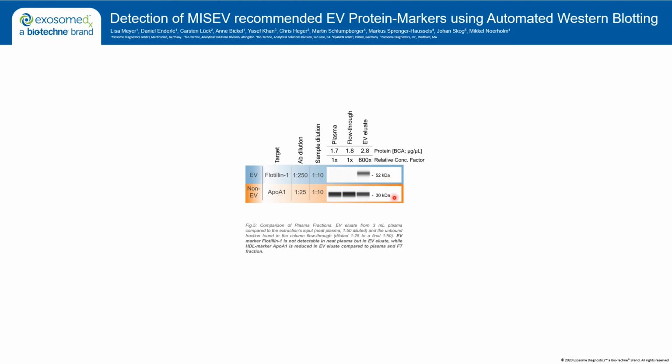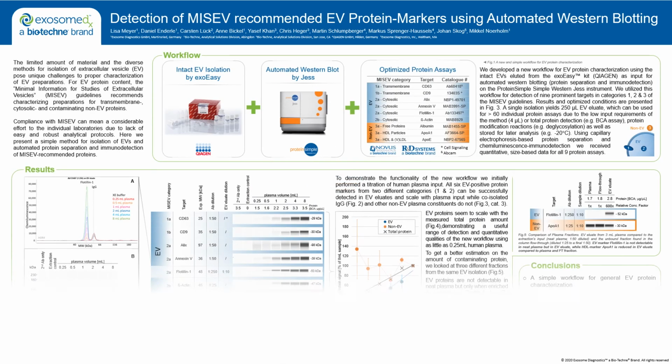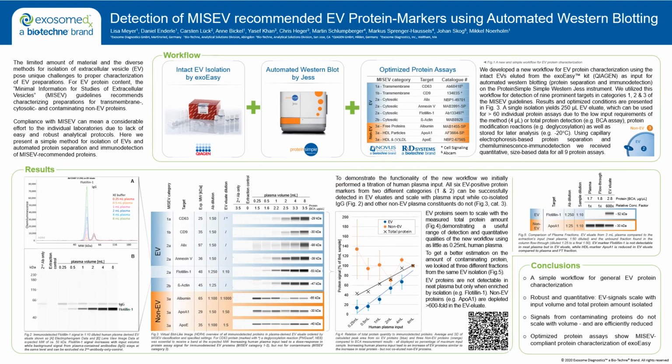like ApoA1 or albumin. To summarize, we developed an easy and robust workflow for EV protein characterization that fulfills the MISEV criteria for analyzed proteins.